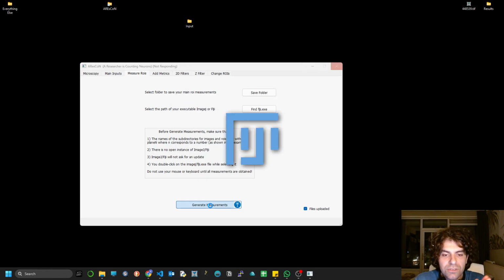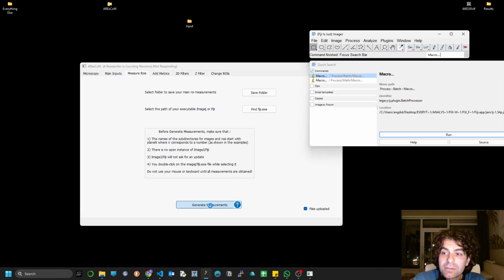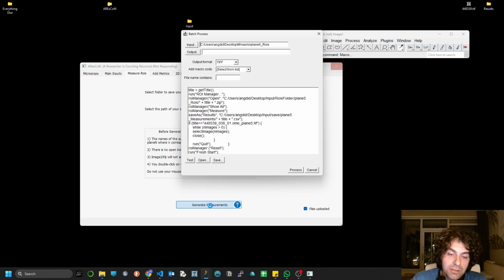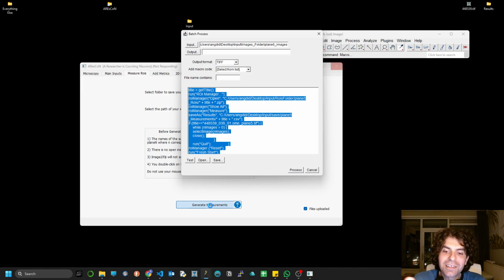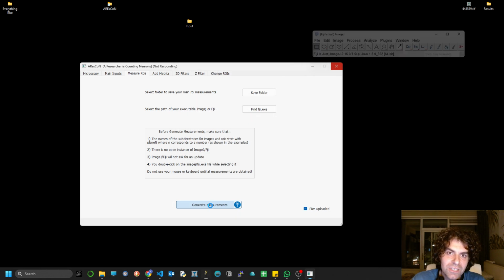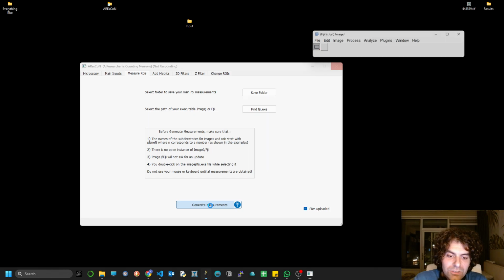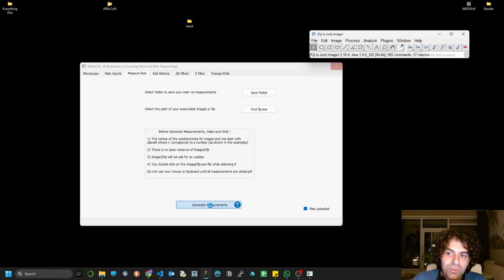If you change versions, it's very possible that AResCoN won't run properly, because there are slight differences between versions in terms of where a particular button is. The way AResCoN works here is that it has a predetermined set of steps, like press tab 5 times and then click on the button that you will end up on. And if the cancel and process buttons, for instance, are vice versa in another version, which happens, then this is not going to work anymore. So please use the version that I will provide to you.